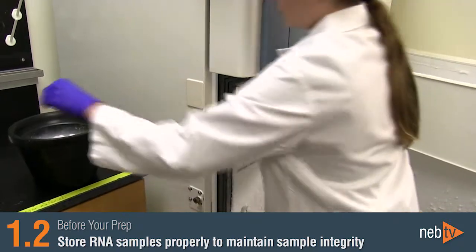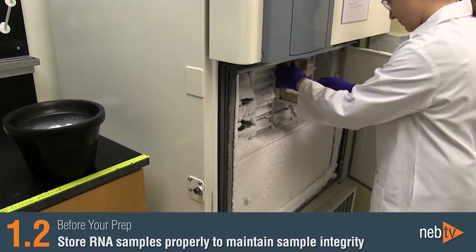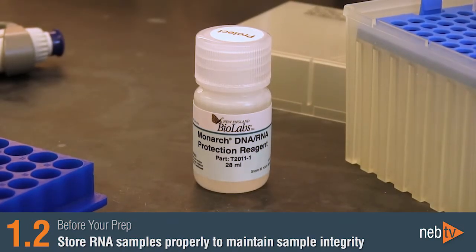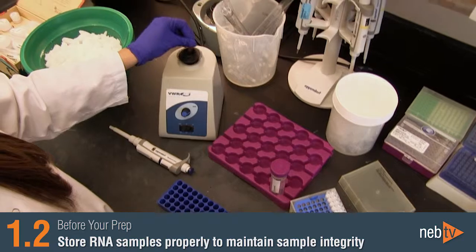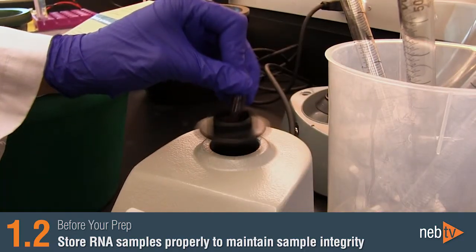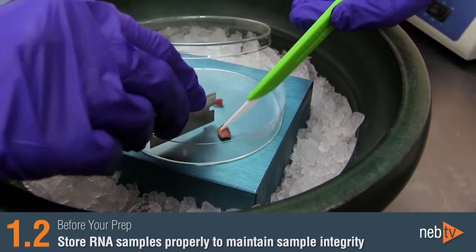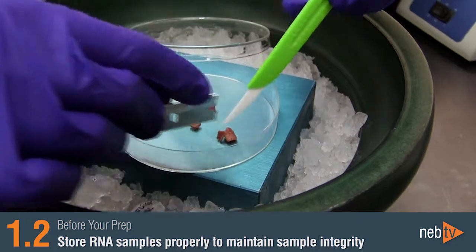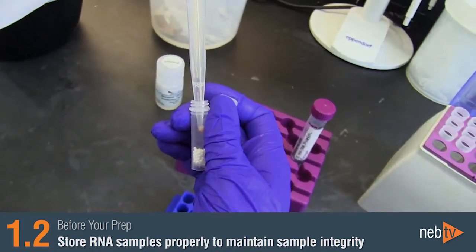To maintain RNA integrity of your sample prior to the prep, samples should be frozen at the time of harvest or protected by a dedicated reagent such as the Monarch DNA and RNA protection reagent, which is included in our kit. Cultured cell pellets or aliquots of blood preserved with this protection reagent should be mixed thoroughly by vortexing or pipetting prior to storage. Small pieces of tissue less than 20 milligrams may be stored directly in the protection reagent. However, larger tissue samples should be homogenized in protection reagent prior to storage.